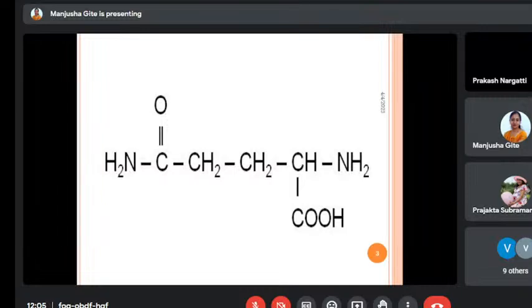Now listen carefully. This is the formula for rule of 13. Why is the name given rule of 13? First line, I told you this rule is used to determine the probable molecular formula of the compound.